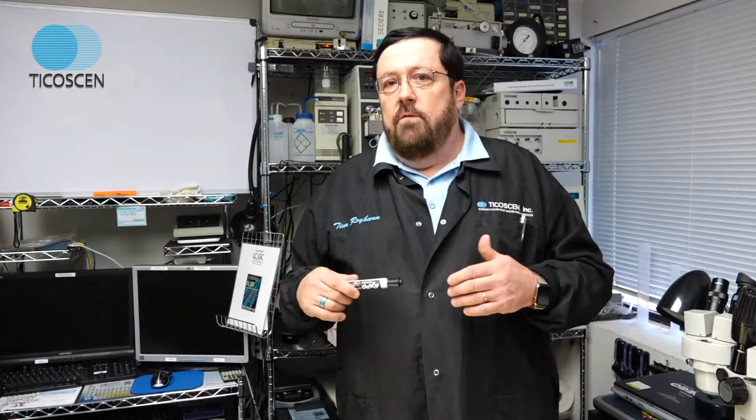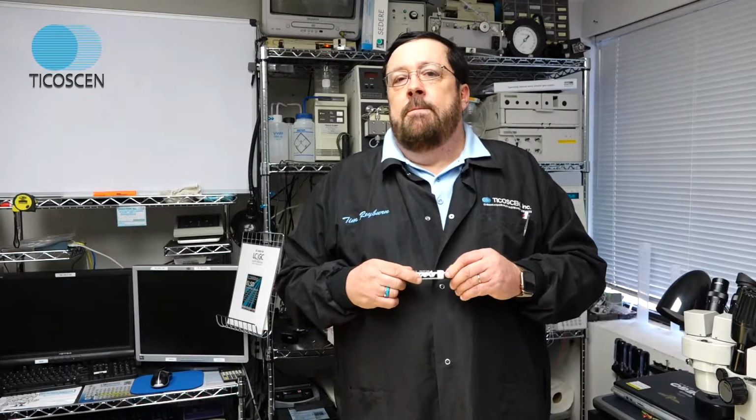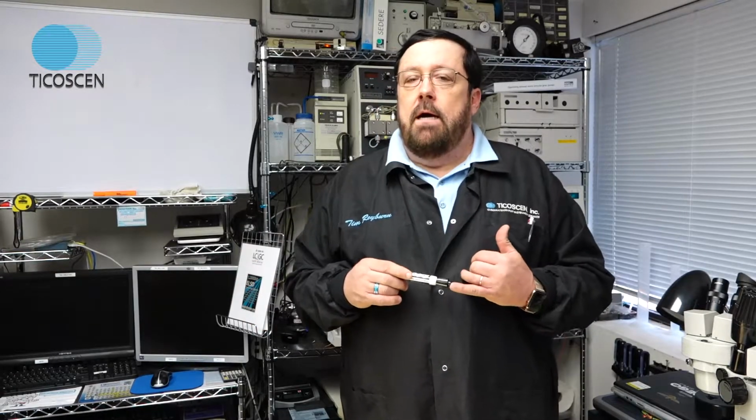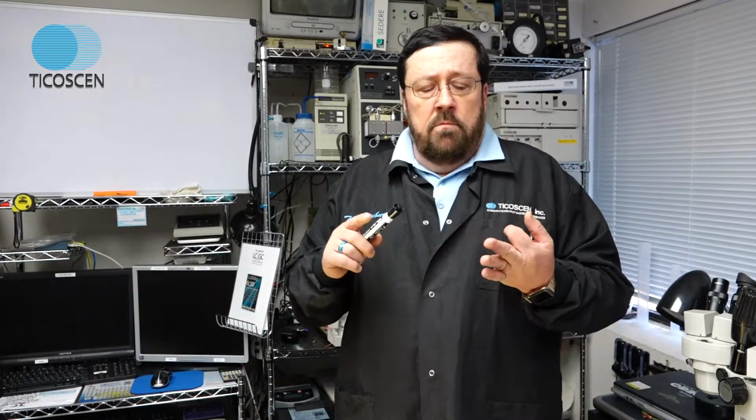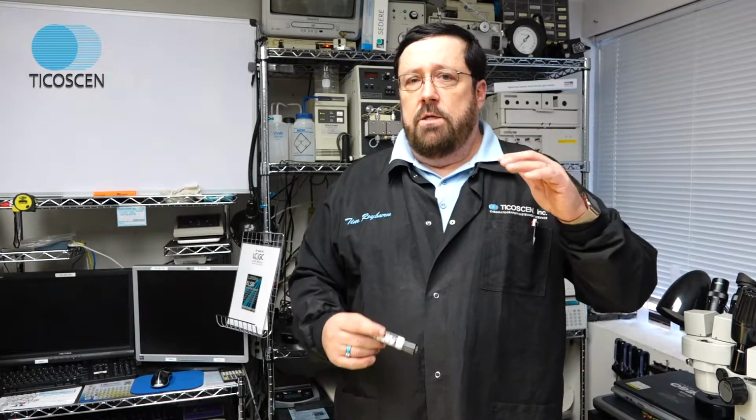So you need to use fresh solvents, mass spec grade solvents. Column bleed, silica bleed, is a common problem with ELSDs, C18, C8 columns. If they're not stored at the proper pH, you go and put the column on, or even a brand new column, the ELSD will see the silica bleed from that column. So if you refer back to the staircase chart and you look at each step of turbidity, you will figure out which step is contributing to your loss of dynamic range from turbidity. It's column bleed, solvent residue, dirty gas. All those things will add up to causing contamination issues on your detector.